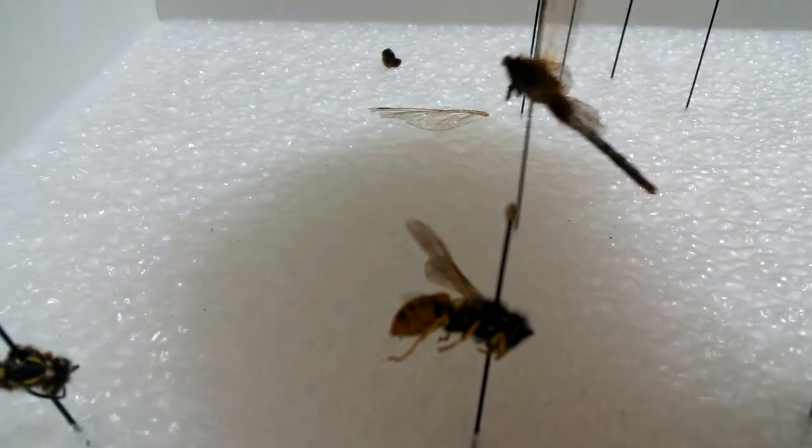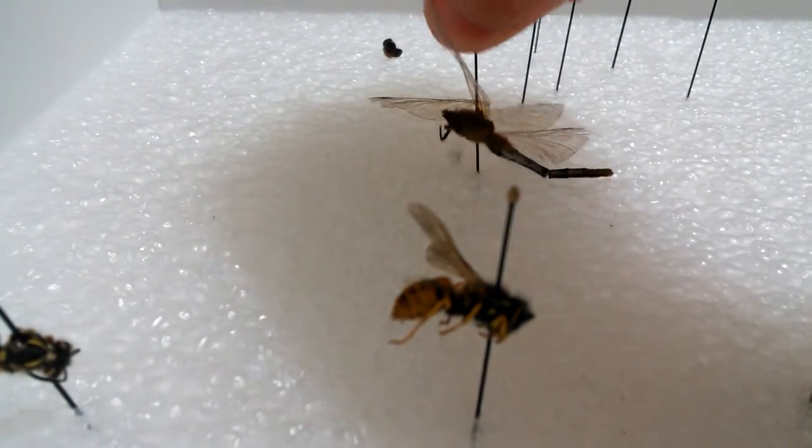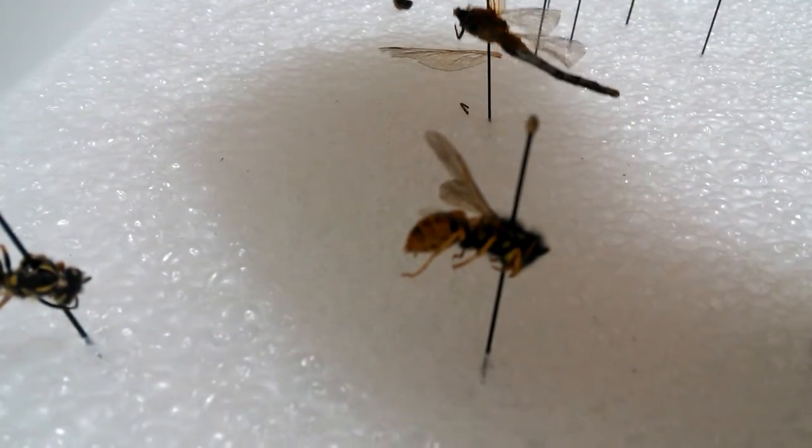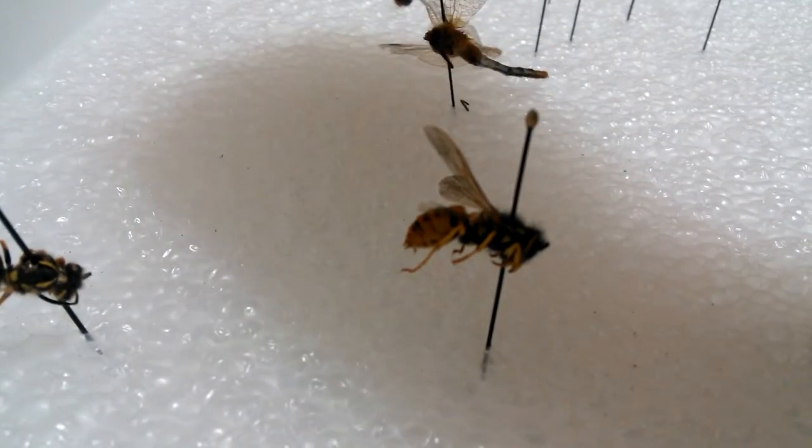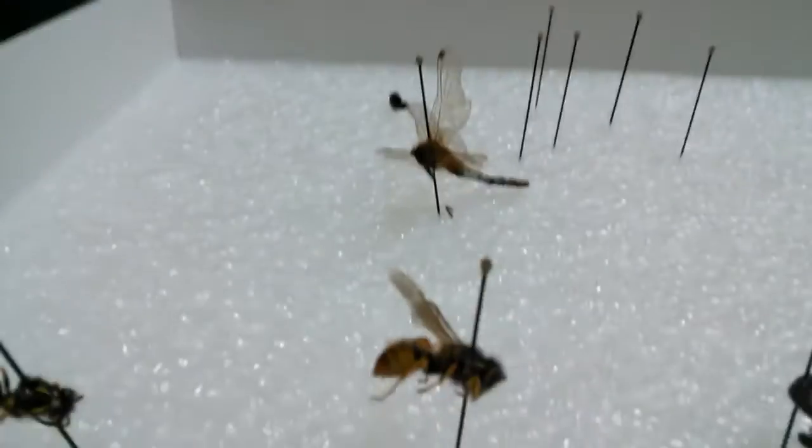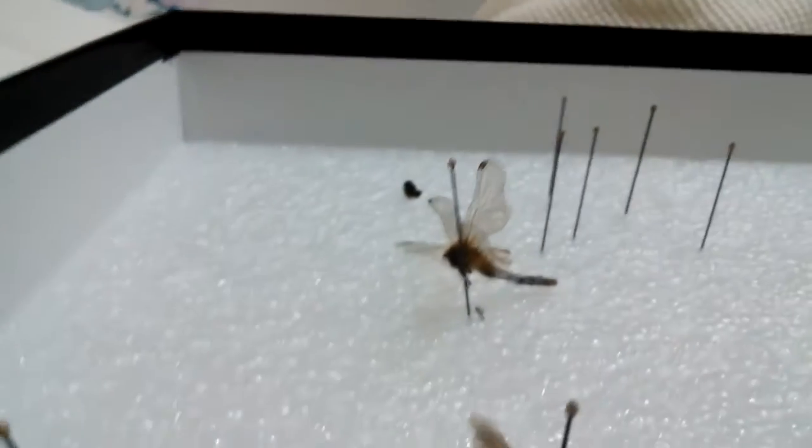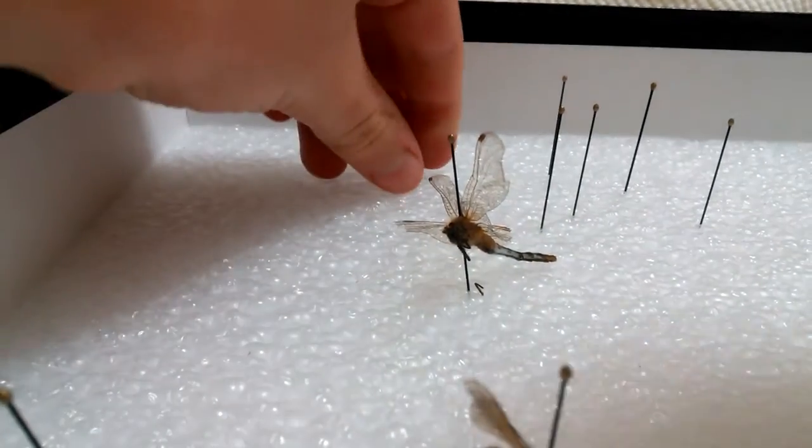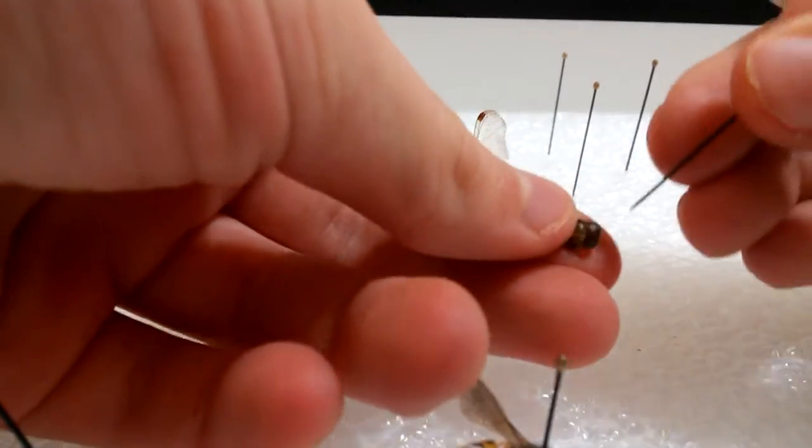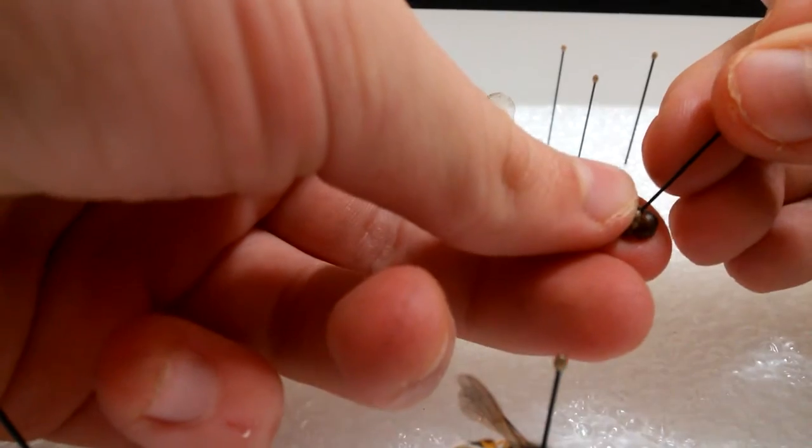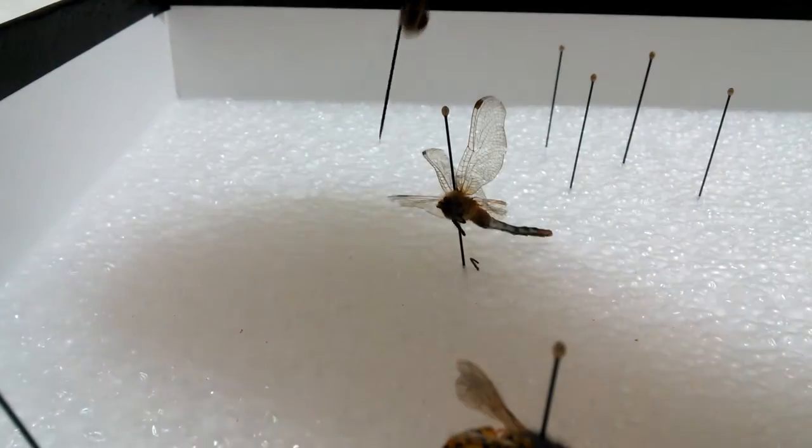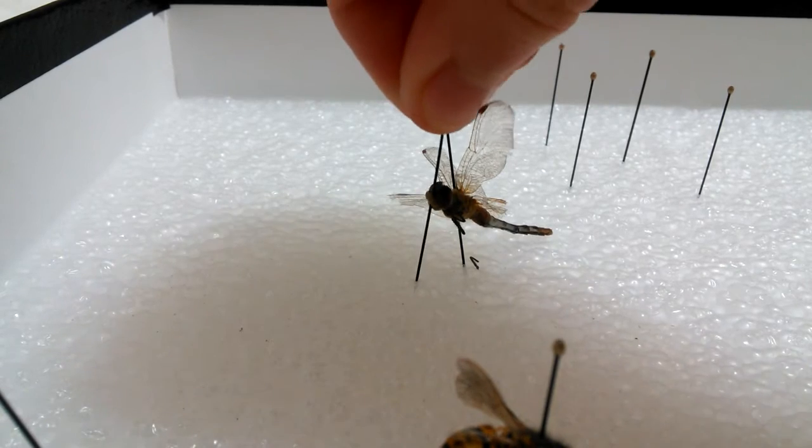You then stick the dragonfly into the foam. And then you need to pin on any excess parts instead of falling off, such as the head. Then you put it against the dragonfly where it belongs.